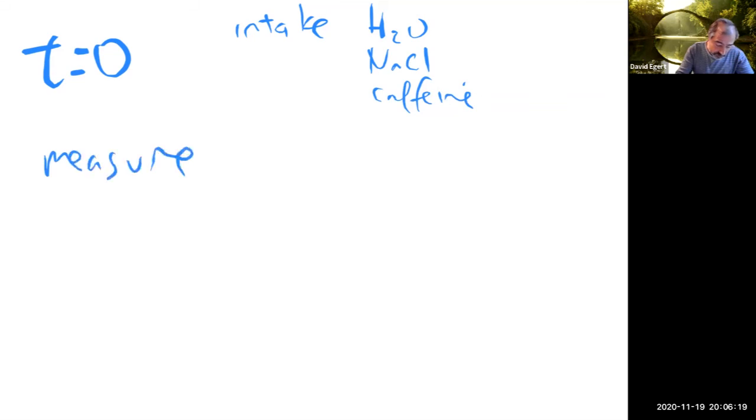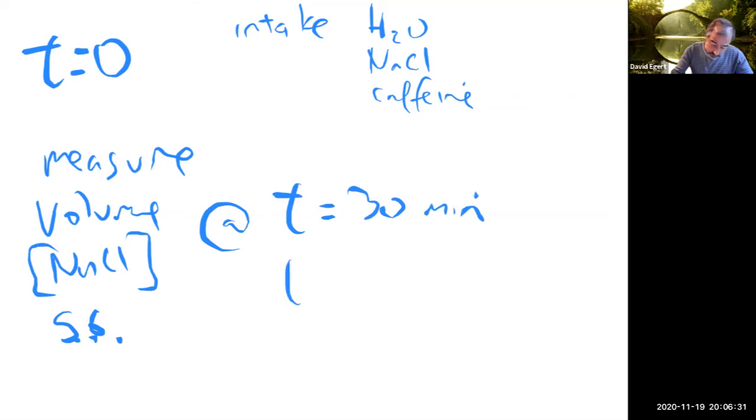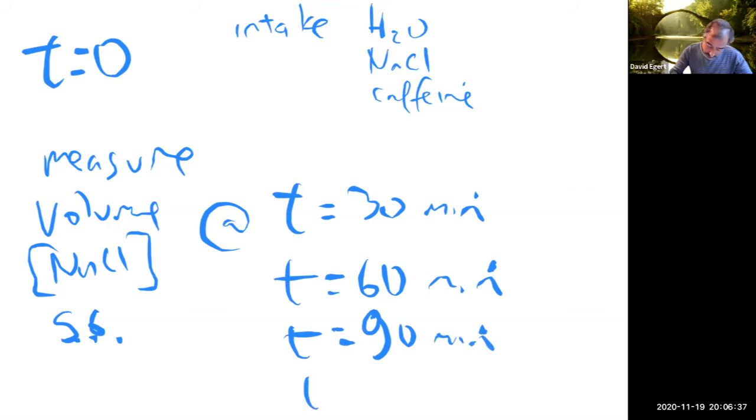We'll measure volume, sodium chloride concentration, and specific gravity at T equals 30 minutes, T equals 60 minutes, T equals 90 minutes, T equals 120 minutes.